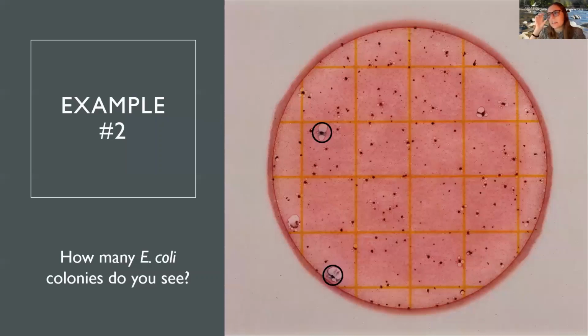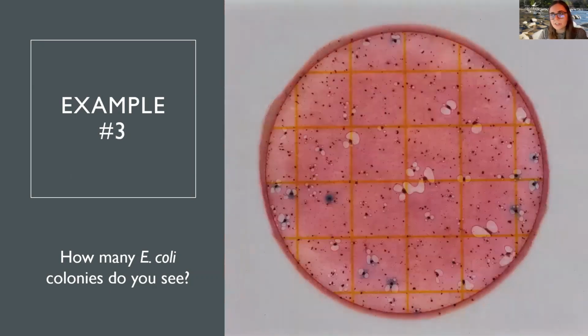And I'll let you guys know too, Jackie told us that we're running in triplicate, right? So having 3 plates per sample. All 3 of your plates are generally in a pretty tight range of the same number. So if we had this, we can expect all of our plates from that sample to be between maybe 0, 1, 2, 3, 4, maybe 5, but I would expect them to all be pretty close together. So that's something to keep in mind. It's a little bit easier. You're not hit with like 2, 1, 7, 90. They're pretty tight in range.